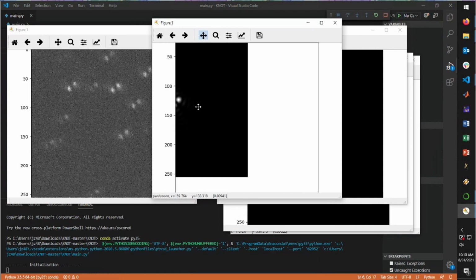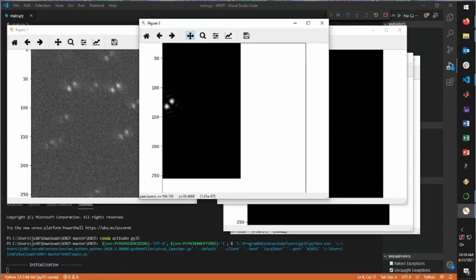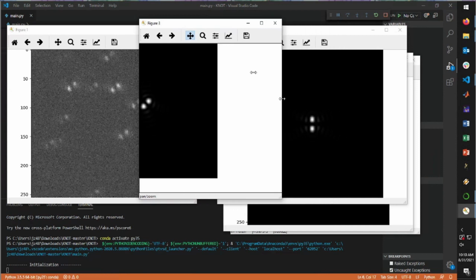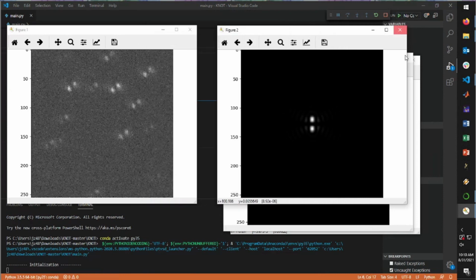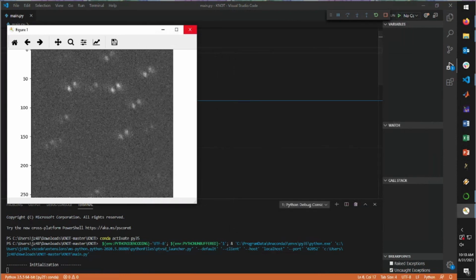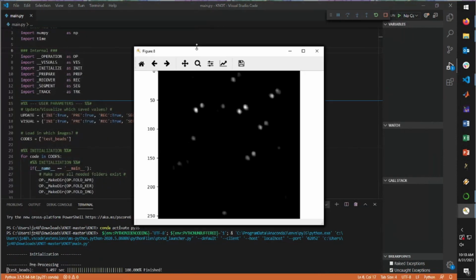For example, we can scooch this closer to the side and see that they compare very well with what we see experimentally. When satisfied, we can close these 5 figures, and then NOT will pre-process the image and the kernel and send more figures your way.